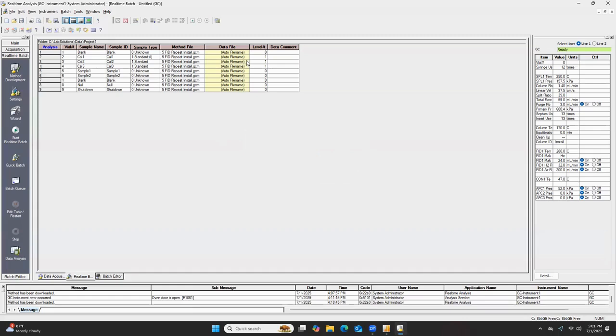Do we need to split between calibration and concentration differently? Do we separate them, add a blank between each concentration, or no need? Because I usually do this with IC. With the FID, it probably shouldn't be as much of an issue. For IC, do I need to split them with the blank? Probably shouldn't be any need to. You could probably run the full calibration curve without running blanks in between each one. Okay. But of course, run blanks before and after.